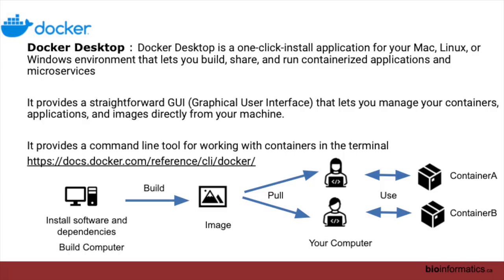Okay. So how are we going to work through some of this stuff? We're going to use something called Docker, and hopefully everyone has a chance to take a look at this and download Docker Desktop. What is this exactly? This is a system to create an environment where you could do analysis on your own computer, where everything is set up in a Docker container, a Docker image, which we're going to turn into a container. It works on all platforms, Mac, Linux, Windows. I think that's all there is. I hope nobody has something other than that.